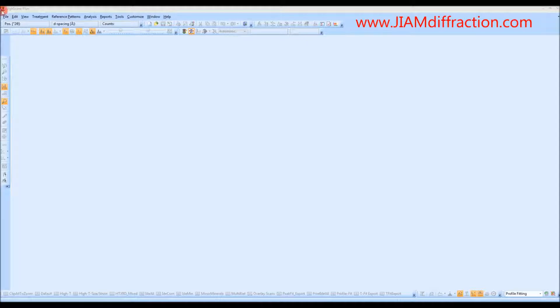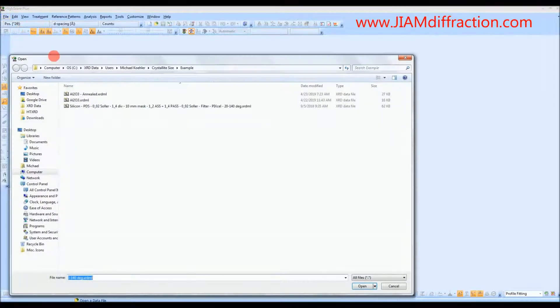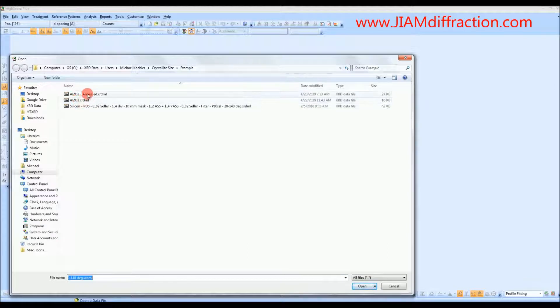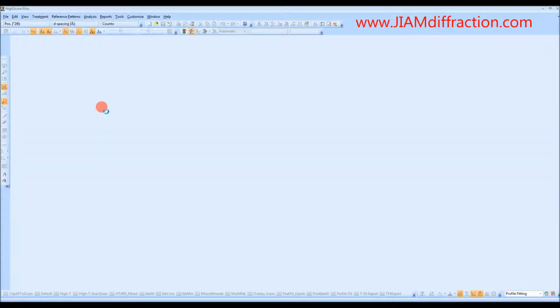To do this, we will start by going to File, Open. These first two are the data files for the samples I want to analyze. Here we have the silicon standard, so we will start with that.